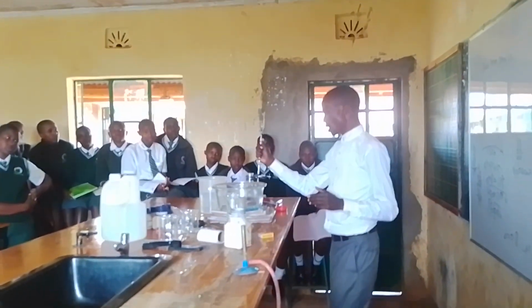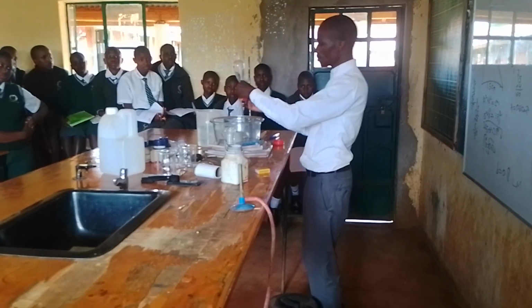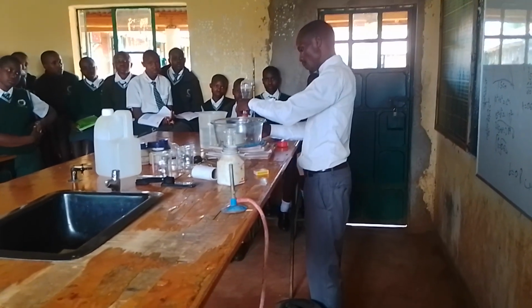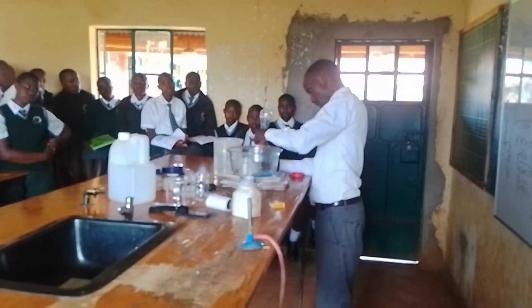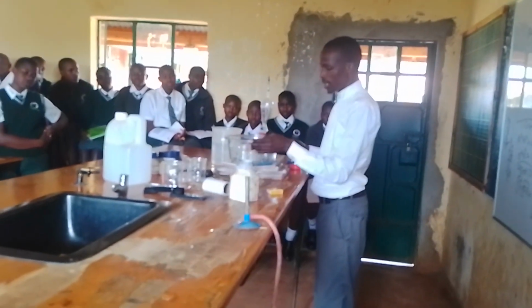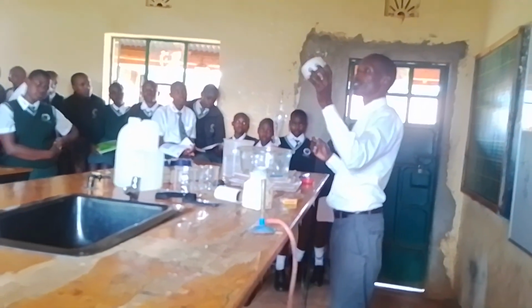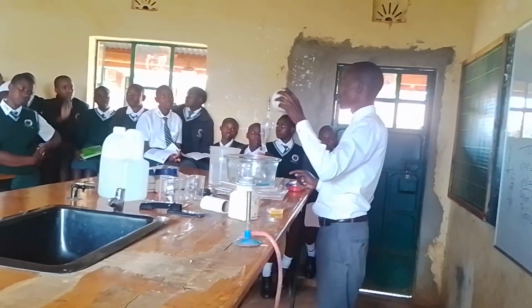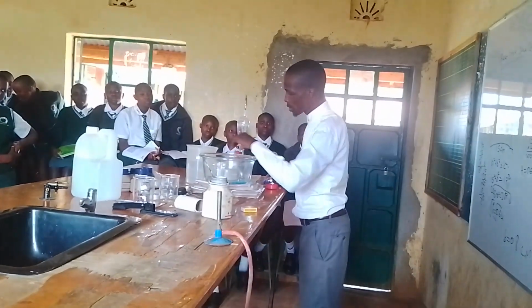So I'll then connect it with our dropping funnel this way. Make everything ready. So you can see, connected with the dropping funnel. This is our trap. This here is what? Someone? Yes. This is our beehive shelf. Is that okay? Yes, it's going to help us do that.